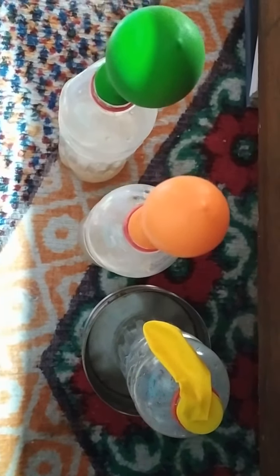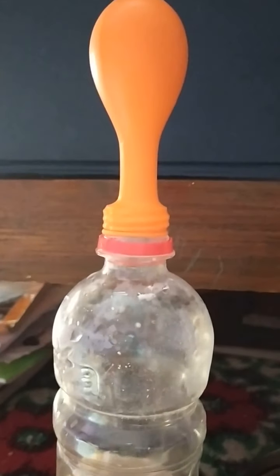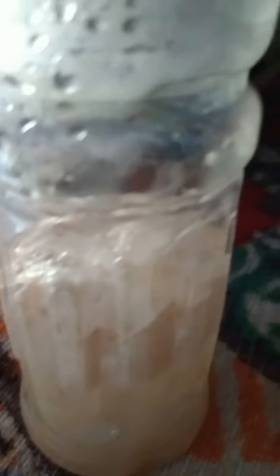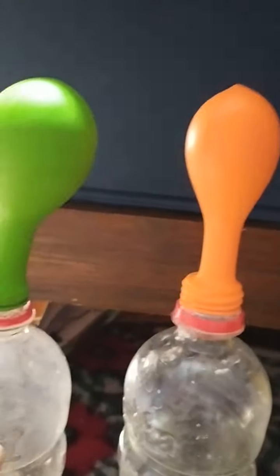After just half an hour you can already see results from the top view. The first bottle is as it is with yeast just forming at the bottom. In the second one the balloon has become straight and the yeast have risen to the upper layer. In the third one there is a thick layer of yeast and the balloon is much bigger.